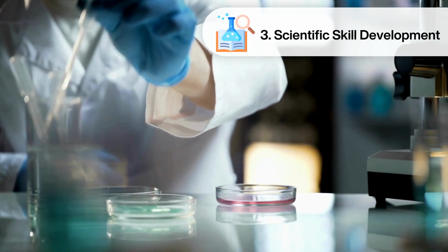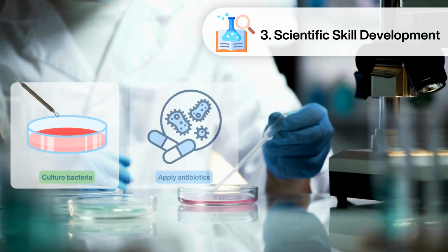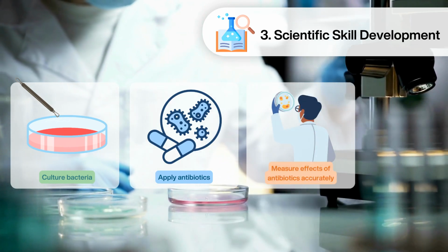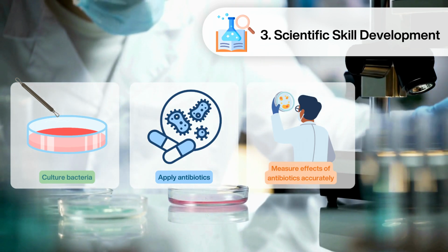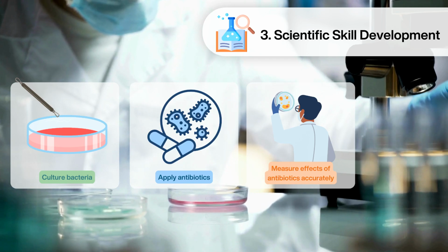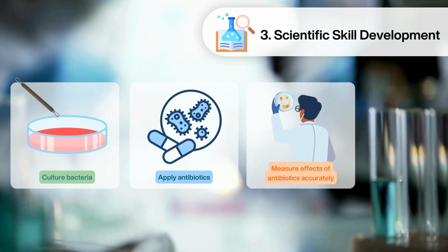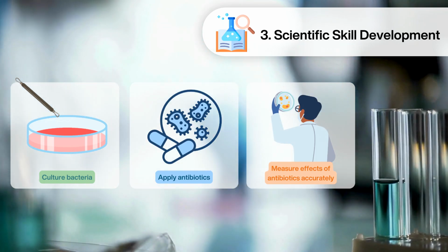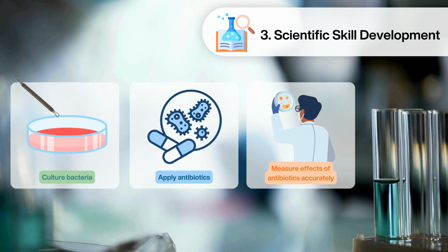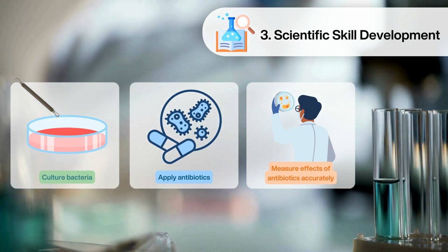Finally, this experiment helps you develop critical scientific skills. You will learn how to culture bacteria, apply antibiotics and disinfectants, and measure their effects accurately. These techniques are fundamental in microbiology and biomedical research. Mastering these skills now lays the groundwork for higher-level scientific studies and research. In summary, this practical is not just an academic exercise. It's an exploration of real-world applications, public health implications, and scientific methodology. Now, let's dive in and see how antibiotics and disinfectants influence the growth of bacteria.